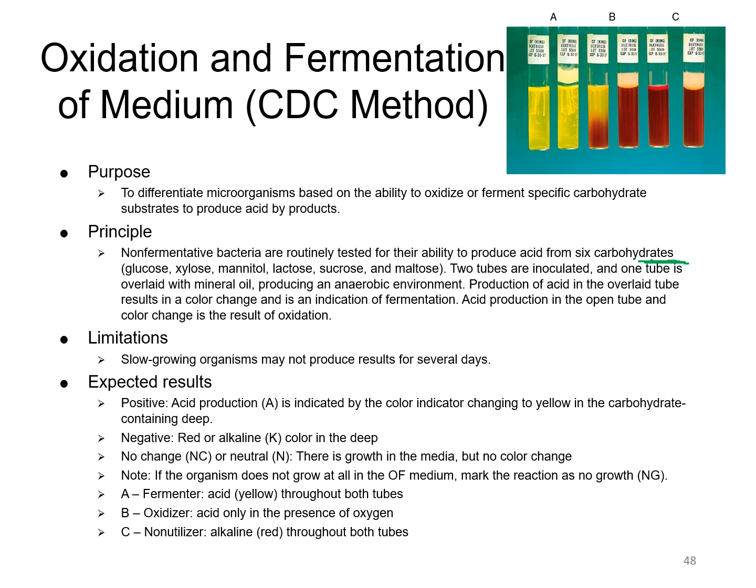You would take a particular medium that has that particular carbohydrate or sugar inside of that media, and you would take 2 of those tubes and inoculate both tubes with several stabs. You can see here up top where these organisms have been inoculated with several stabs into that media, and you can see those little stab marks.